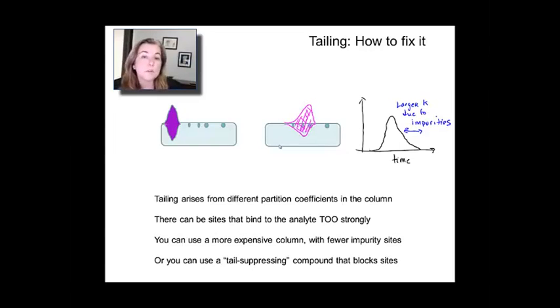Or another cheaper thing to do because often you pay a lot for those columns is to use a tail suppressant. So, for example, a lot of amines can be used in small concentrations. And they effectively go and they hang onto those defect sites and they block them for the analyte coming over. So, that's another strategy that you can use.